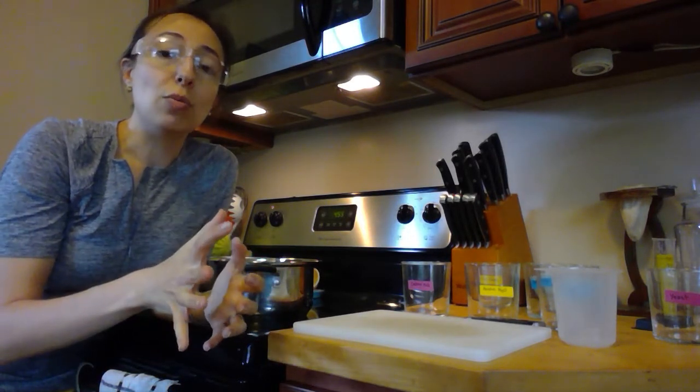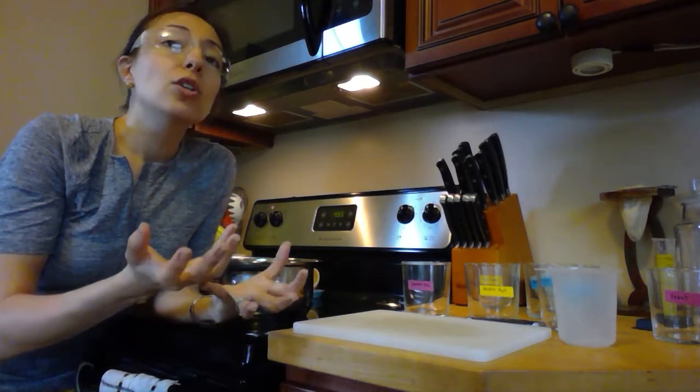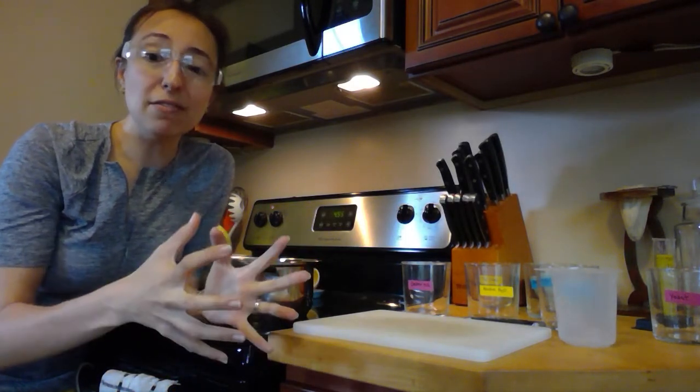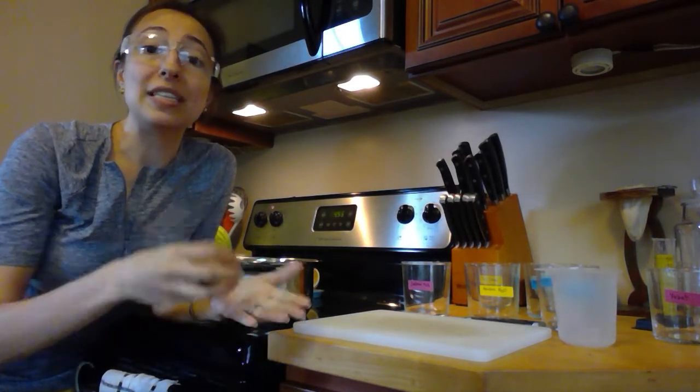Now, your dish soap could have a certain pH to it. Maybe that's something that you test. So if you go, just make sure to rinse it thoroughly with water. And again, as you go through the lab, we want to think about being safe. So when you do dispose of these different chemicals, make sure you're doing so in a safe way.